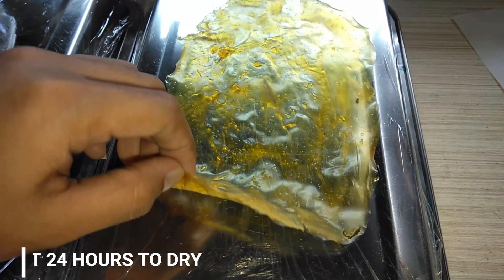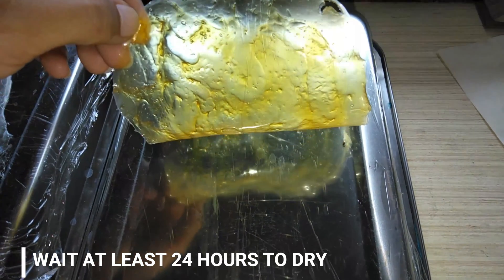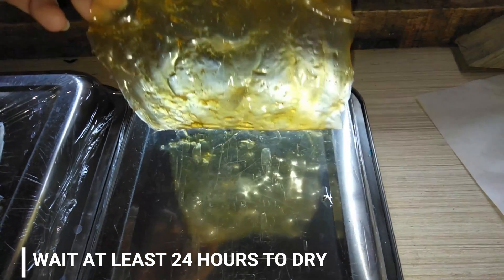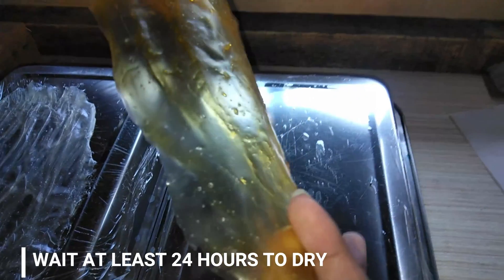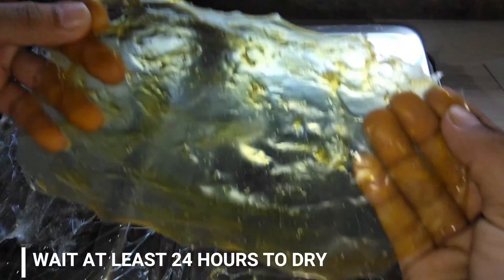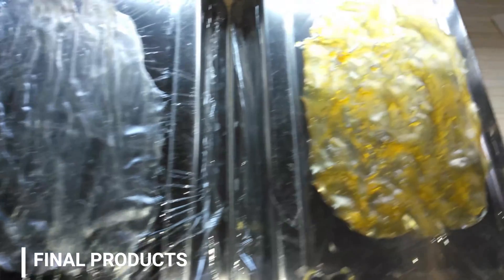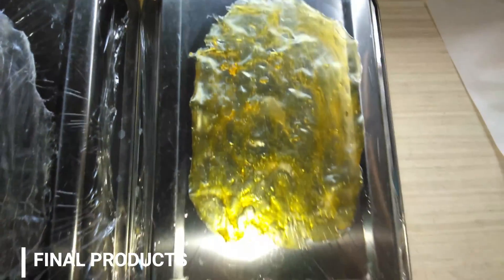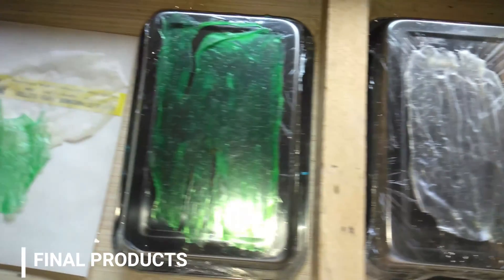Wait at least 24 hours for the plastic to be completely dried. Finally, these are the products that we have done, and now we will test if they will melt in hot or warm water. Thank you.